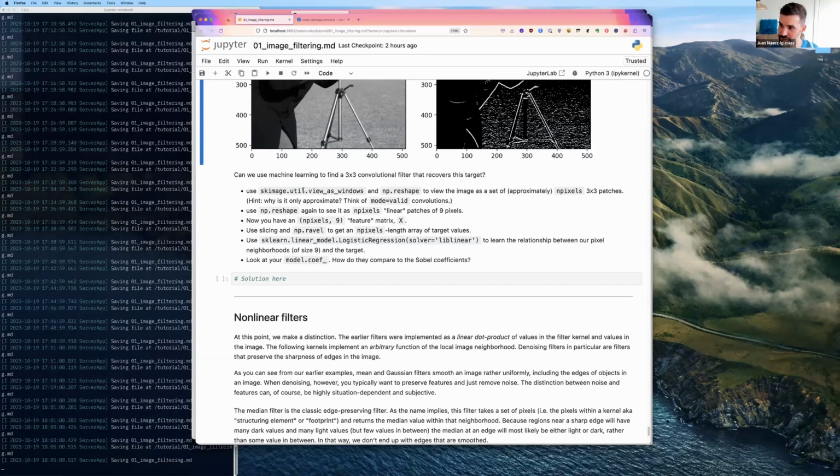So these are all of your independent samples that you're trying to learn from, and then number of features columns. So every sample has a bunch of features, and you're trying to predict the output of that sample based on those features. So we need to convert our image patches, the little 3x3 image patches that we saw before, to feature vectors, which are of length 9.